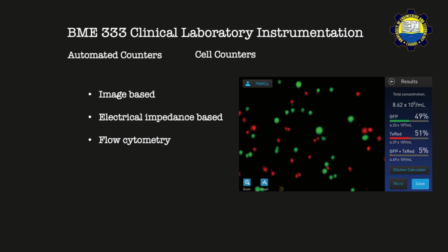So you're able to tell, and this reminds me, it's pretty much similar to what we studied in scanning electron microscopes, where we had an electron beam hitting the sample and then being recorded at different sensors to understand what the physical nature of the specimen was.